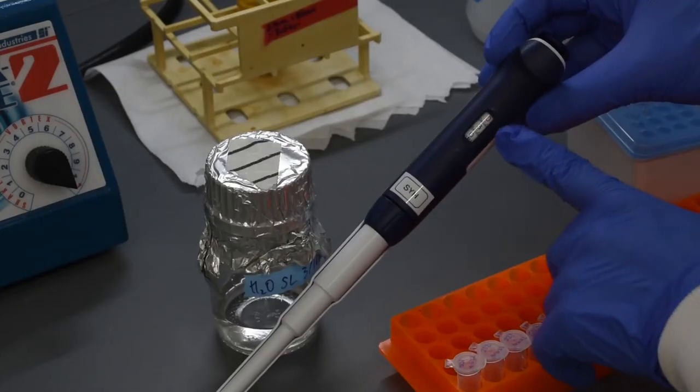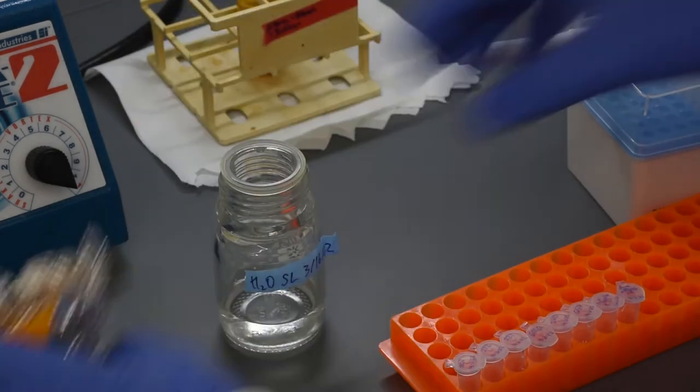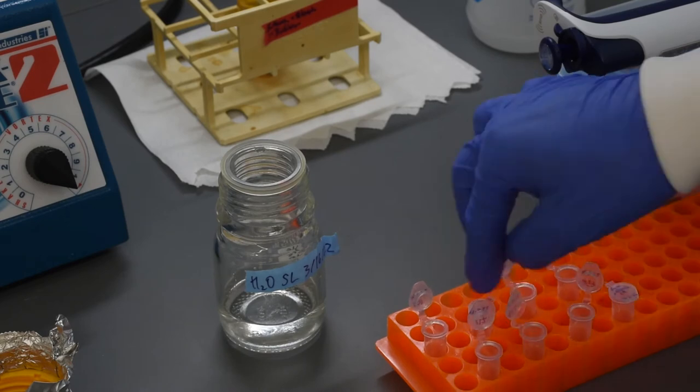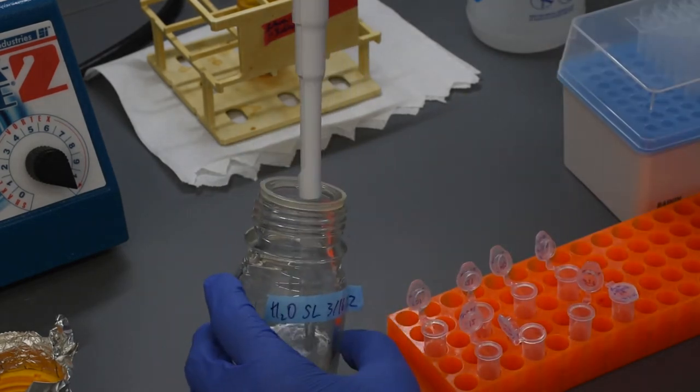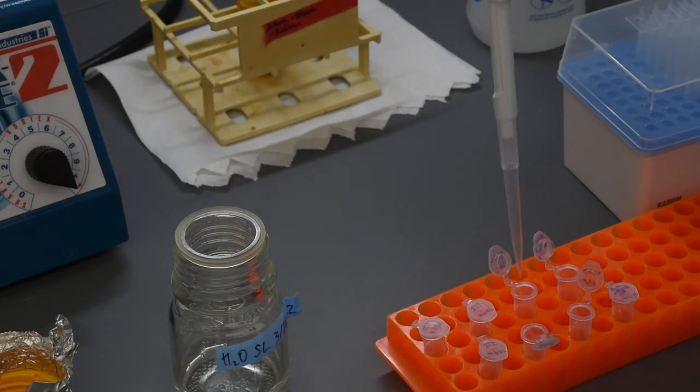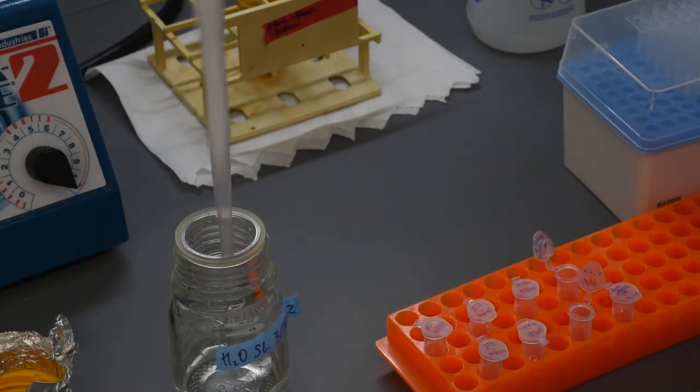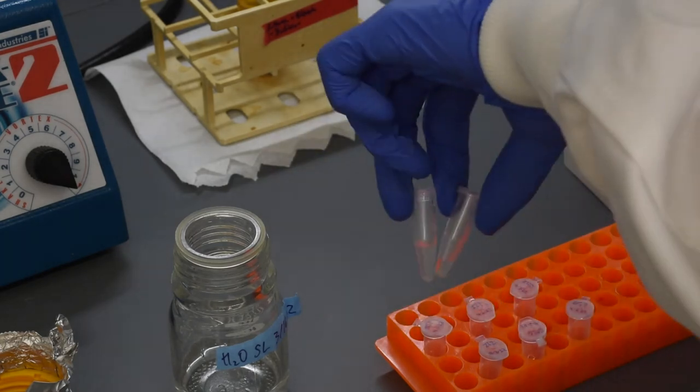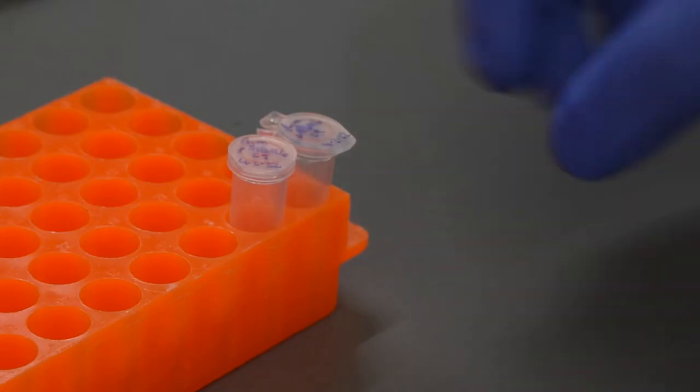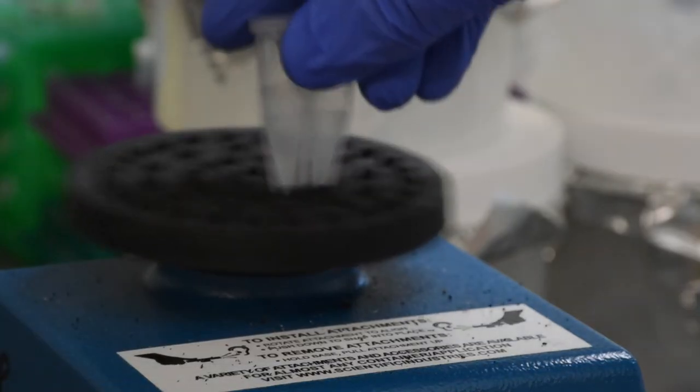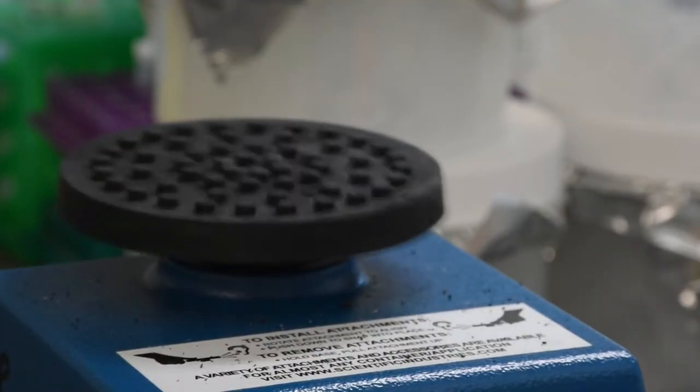Add 300 microliters of sterile water to each of the yeast tubes. Add 300 microliters total to the agro tubes, combining the cell pellet volumes to make a denser suspension. Vortex each tube to resuspend the cells.